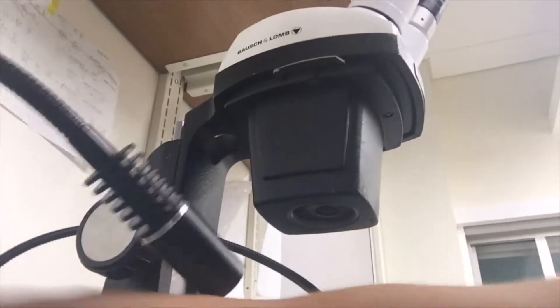Now I'm over by my station, which includes this beautiful microscope, my fly pad, my microscope light, and a fly morgue for killing off flies I don't need — which I will not be doing today. I will just be flipping them and making sure they stay alive.